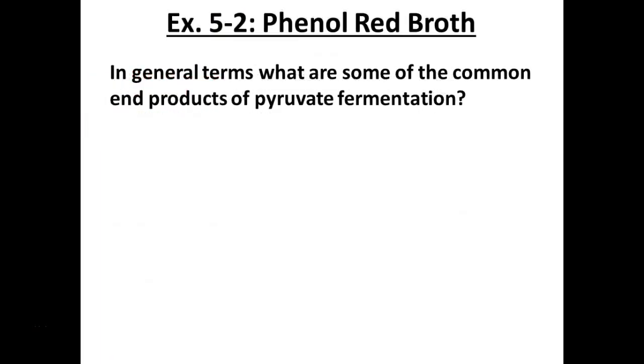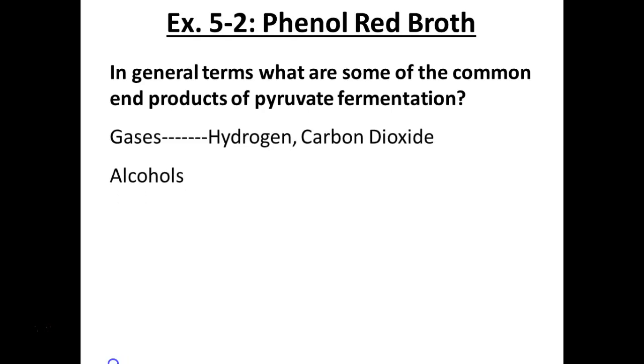And again, depending on which sugar you want to ask the question for would determine which sugar you would put in that media, and we use the glucose. So what's the common byproducts of fermentation? Alcohols and acids and gas. And gases are just hydrogen and carbon dioxide.